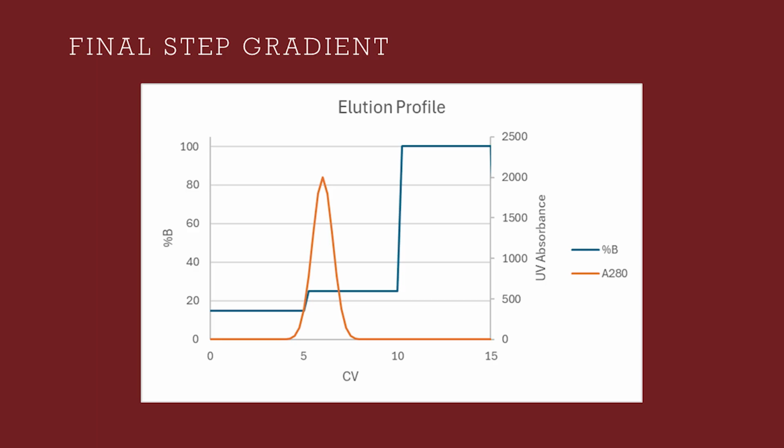Once you've picked your wash and elution points, it's always worth running a quick confirmation step gradient run, just to make sure the real-world behaviour matches what the linear gradients predicted. It takes almost no time, and it gives you the satisfying right to say, "Yes, Kevin, the step gradient works. Thank you for your concern."